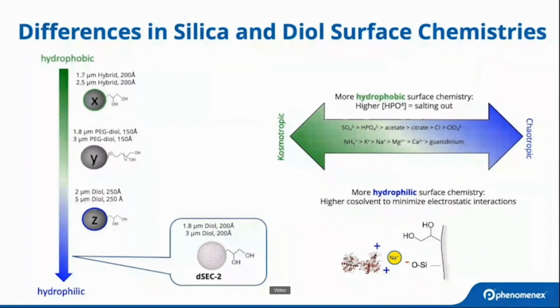One of the mechanisms for aggregation is partial exposure of hydrophobic pockets of the protein. An overly hydrophobic surface may be problematic in size exclusion methods when you're looking at aggregation itself. And this is especially true with methods like the USP, which uses high levels of phosphate in the mobile phase. Phosphate does ensure protein stability. However, the partial salting out caused by the phosphate may pose some issues with an overly hydrophobic particle.